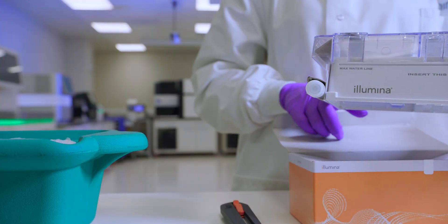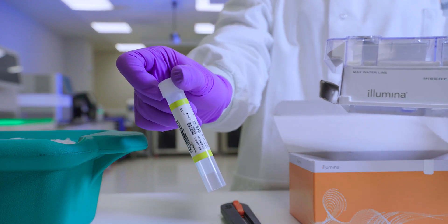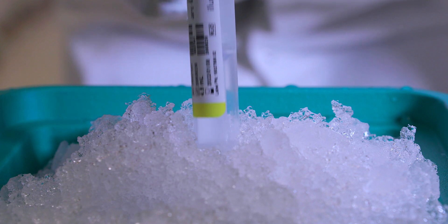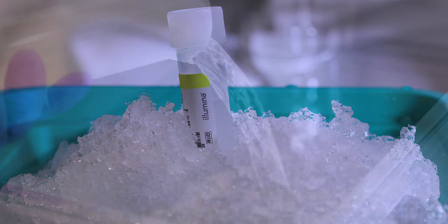The box also contains the HT1 buffer, which we will not use in this video. You can place the HT1 buffer on ice or return it to the freezer while preparing the reagent cartridge.